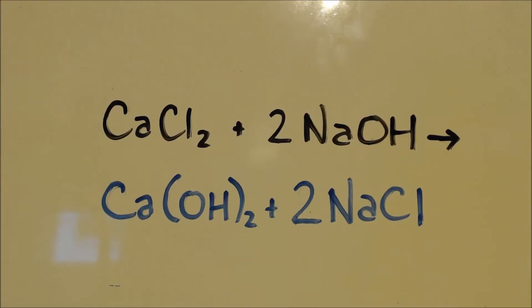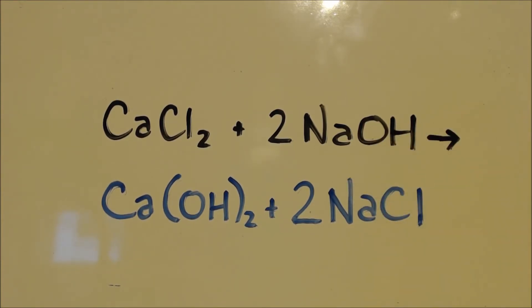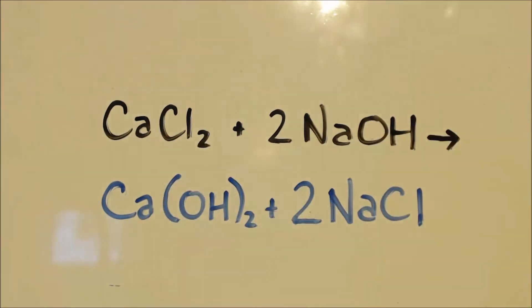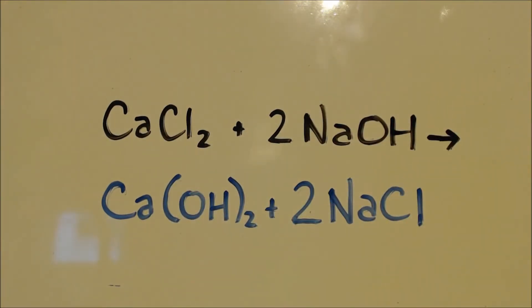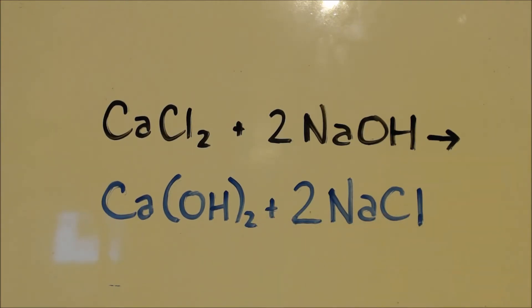This is John Black, super chemist, here to show you how to make some calcium hydroxide. Here's the equation: I'm going to use some calcium chloride and some sodium hydroxide. You can see I need twice as much sodium hydroxide as I do calcium chloride, so I'll have to keep that in mind. It will make calcium hydroxide and some table salt.